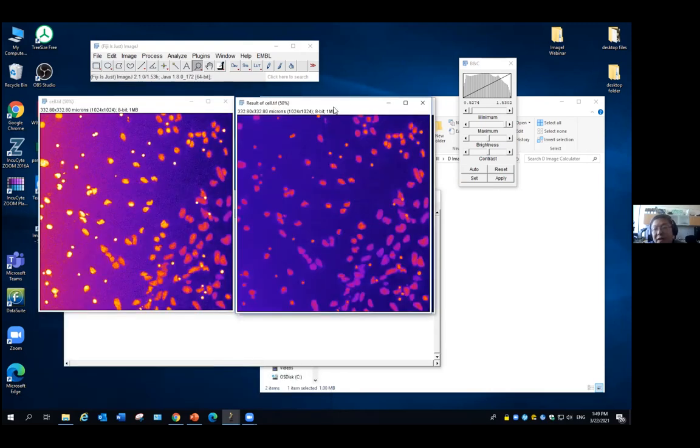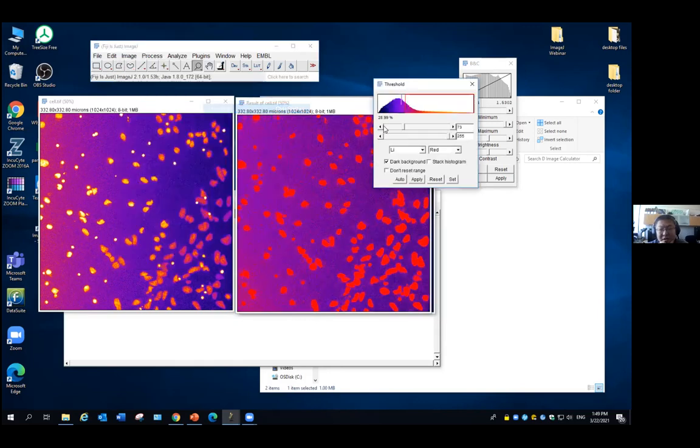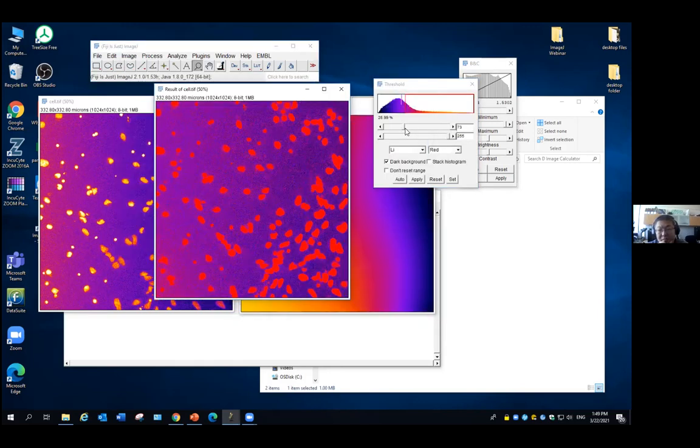So this is the result. If I do a thresholding, as you can see, we still have a kind of noisy image. We haven't changed that. We still need to apply a smoothing filter on it. But you can see when you move around, the right side and the left side are normalized. They have the same kind of background. We corrected the uneven illumination.